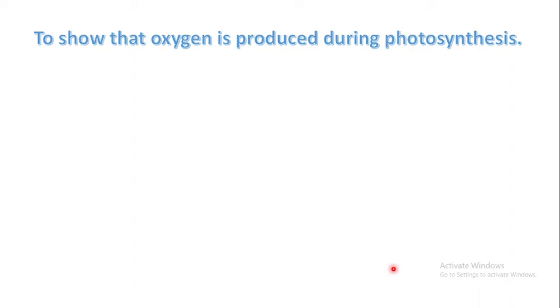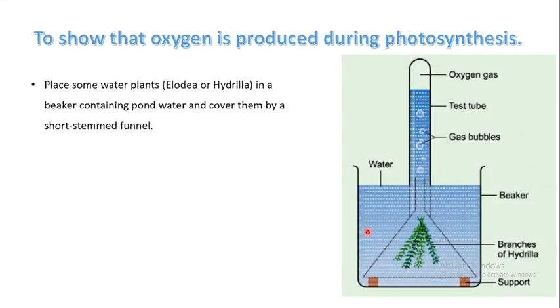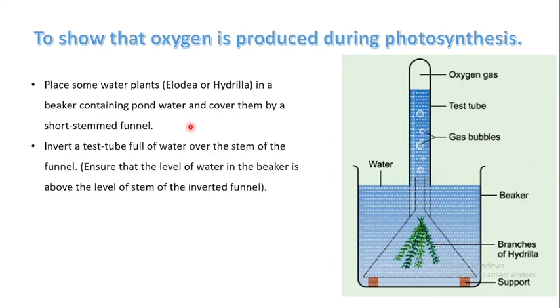Now let us see an experiment to show that oxygen is produced during photosynthesis. Place water plants like Hydrilla or Elodea in a beaker containing pond water — not distilled or RO water — and cover them with a short-stemmed funnel. Then take a test tube completely filled with water and invert it over the stem of the funnel. Ensure the water level in the beaker is above the stem of the inverted funnel.